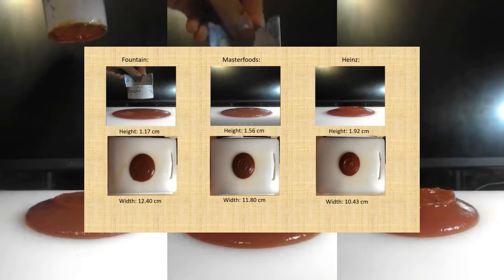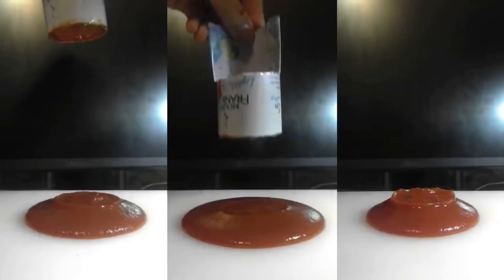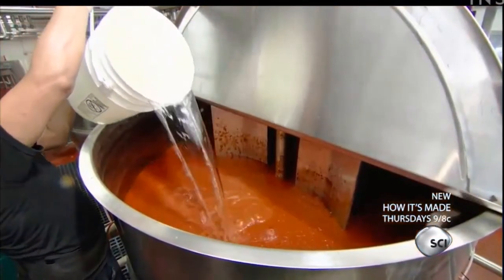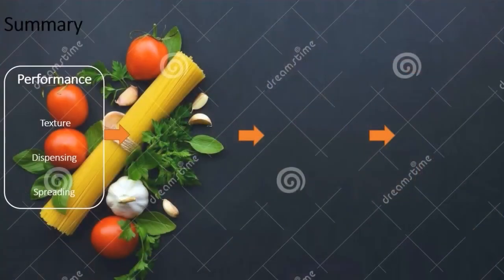Further results show that after removing the container, Heinz tomato sauce spread less than the other two brands, which indicates the biggest yield stress. Yield stress in tomato sauce is caused by the branched network structure, which results from attractive particle-to-particle interactions. And homogenization in the manufacturing process will result in different yield stress. The microstructure will be destabilized by over-homogenization.